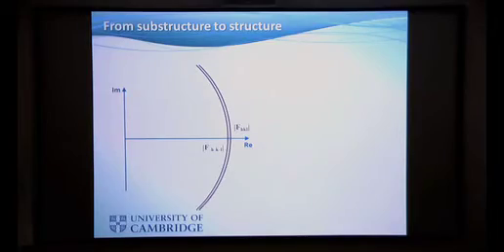For strong reflections, we have now seen what happens if FHKL is much bigger than its Friedel mate. We have seen what happens if the Friedel mate is very big as compared to FHKL. If they're the same? Yes, thank you. Less, more, and same.